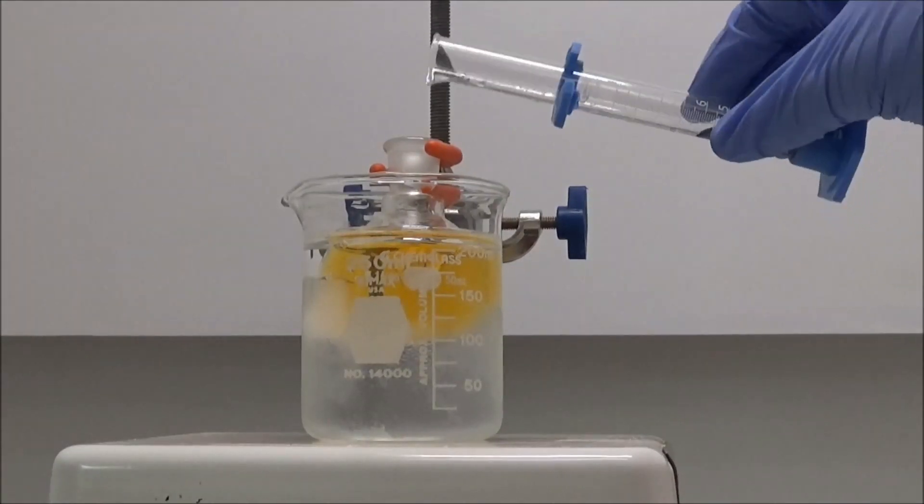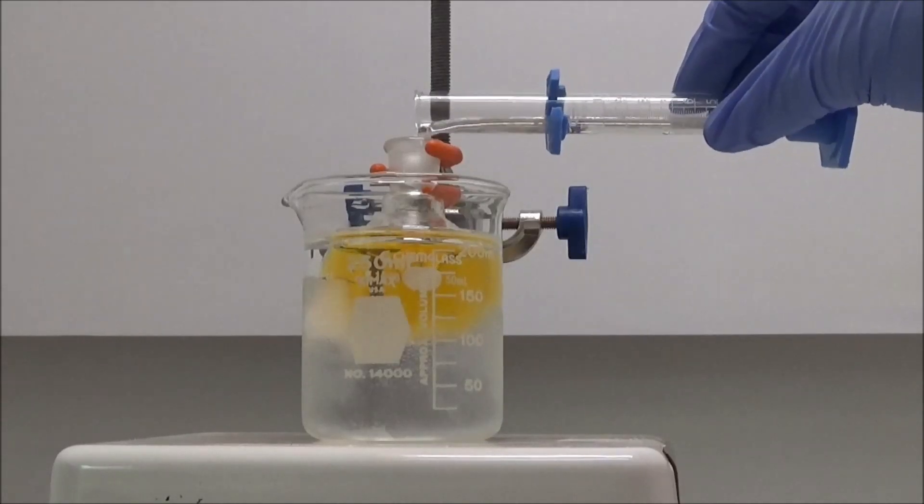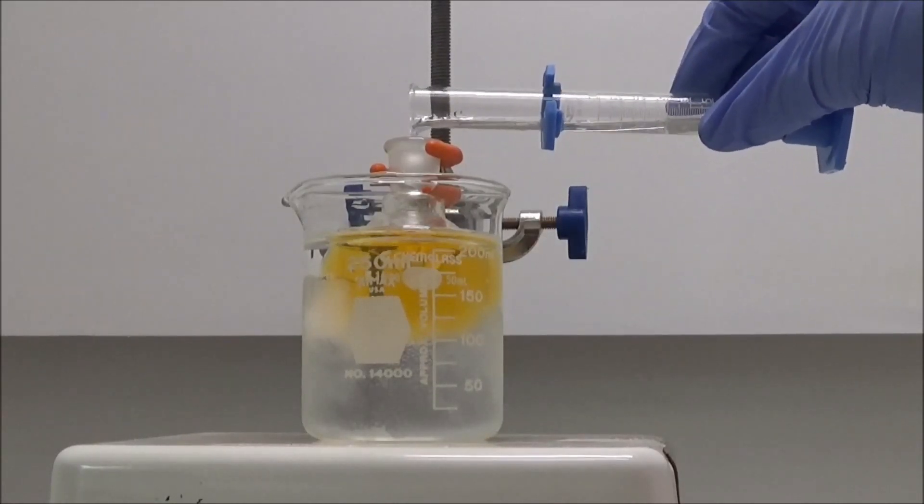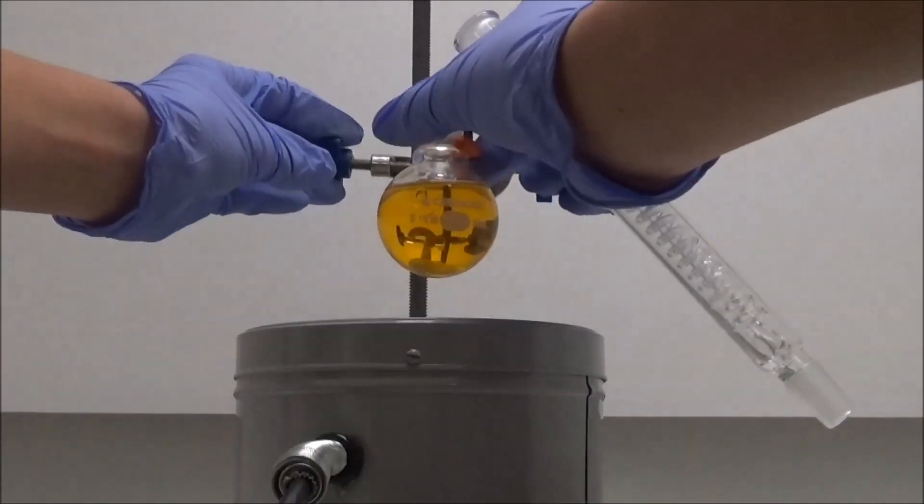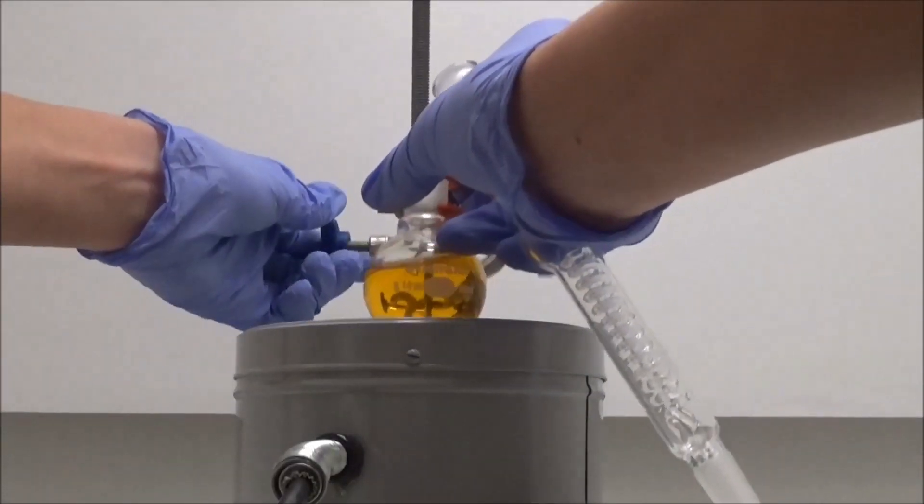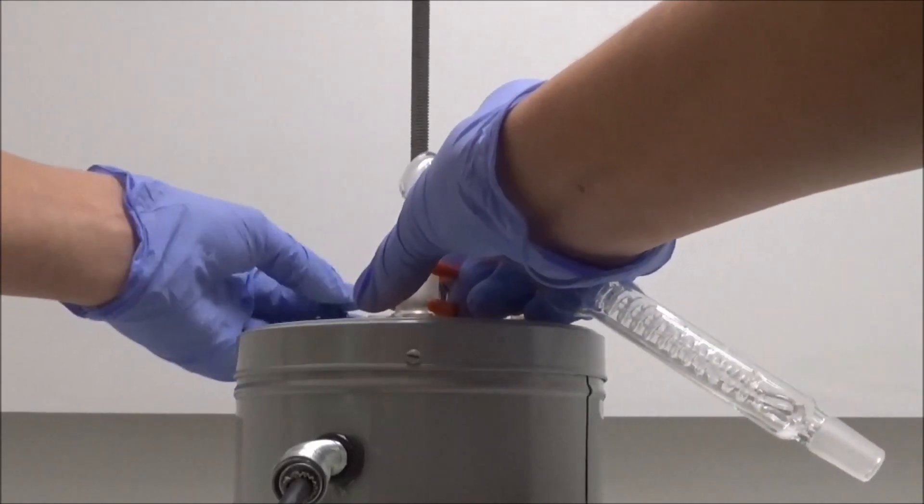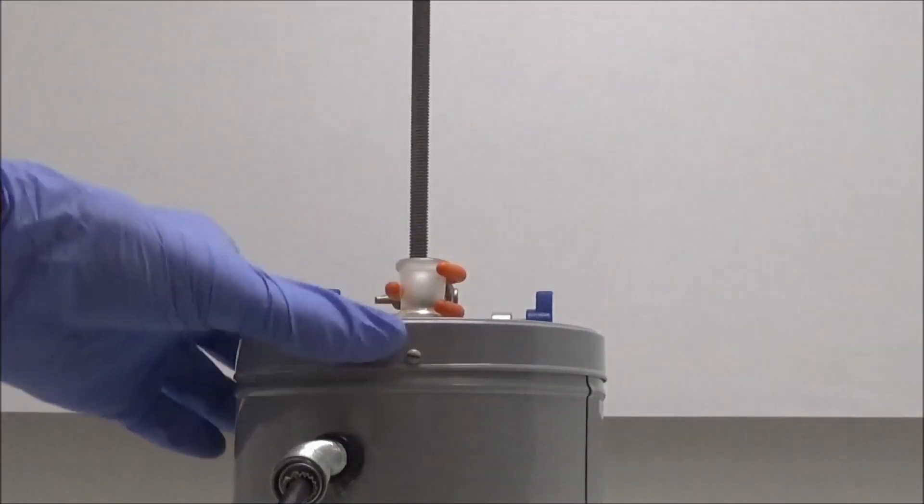Finally, I added 3.3 milliliters of concentrated sulfuric acid. The flask was lowered into my oversized heating mantle, and a condenser was placed on top. This is preparing for the reflux that will take place next.